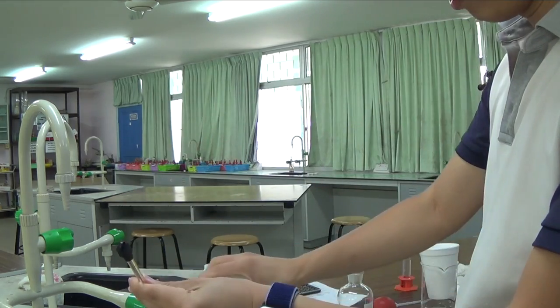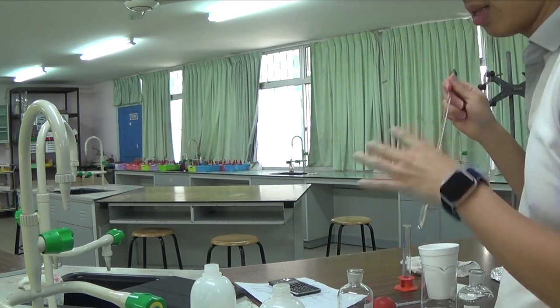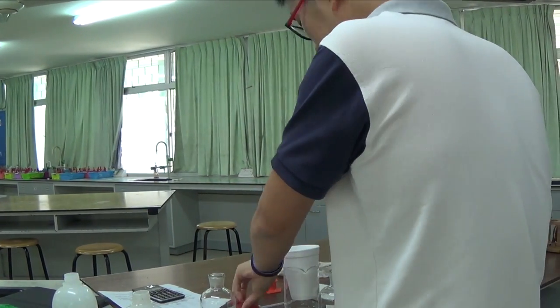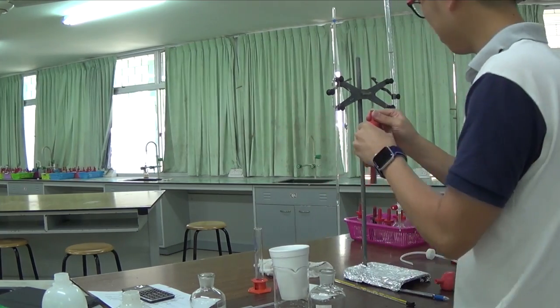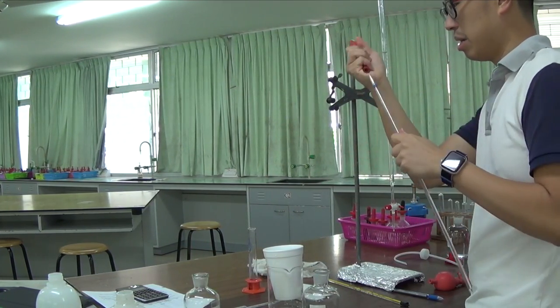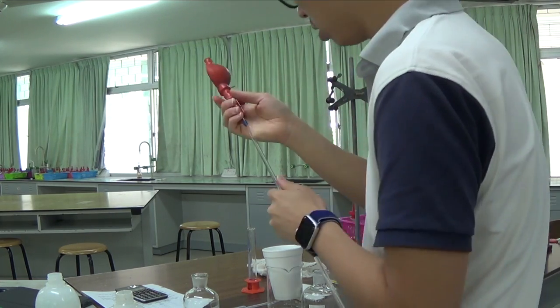I also remember to rinse my thermometer and wipe it. Supposedly you get a clean tissue paper. I don't have a clean tissue paper here, but the towel will have to do. This is the last experiment. This is experiment 7, where we are not diluting the burette solution.